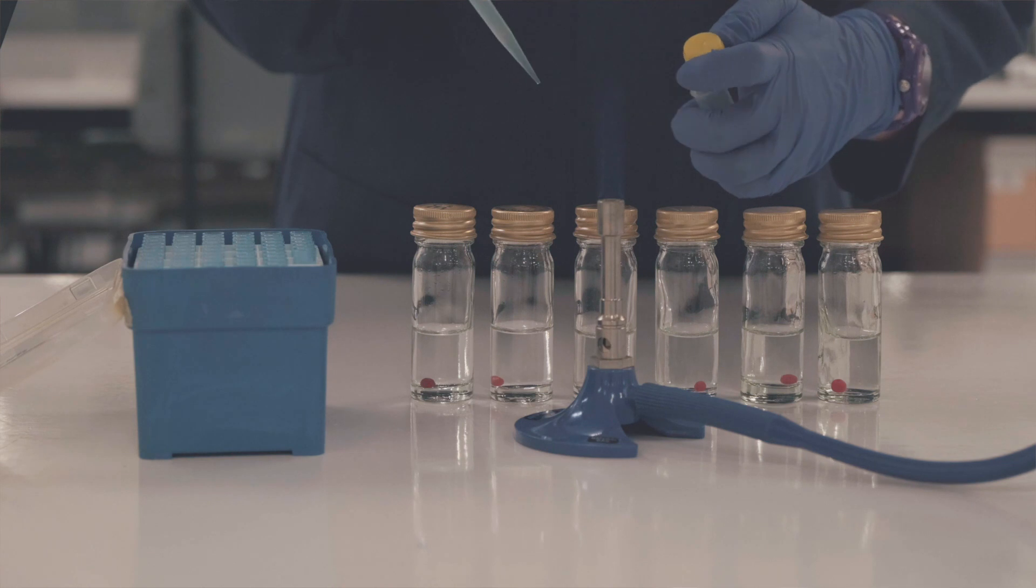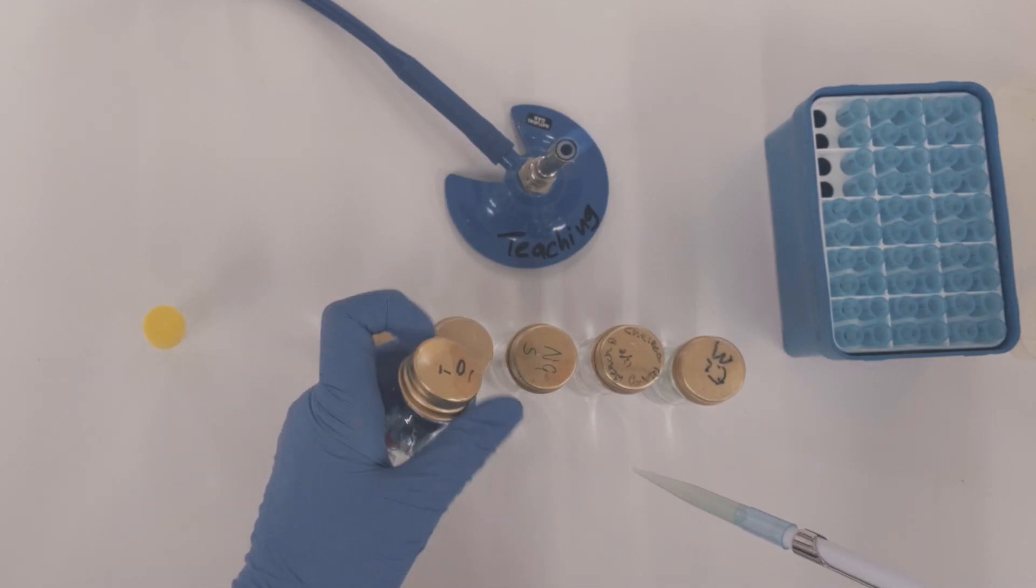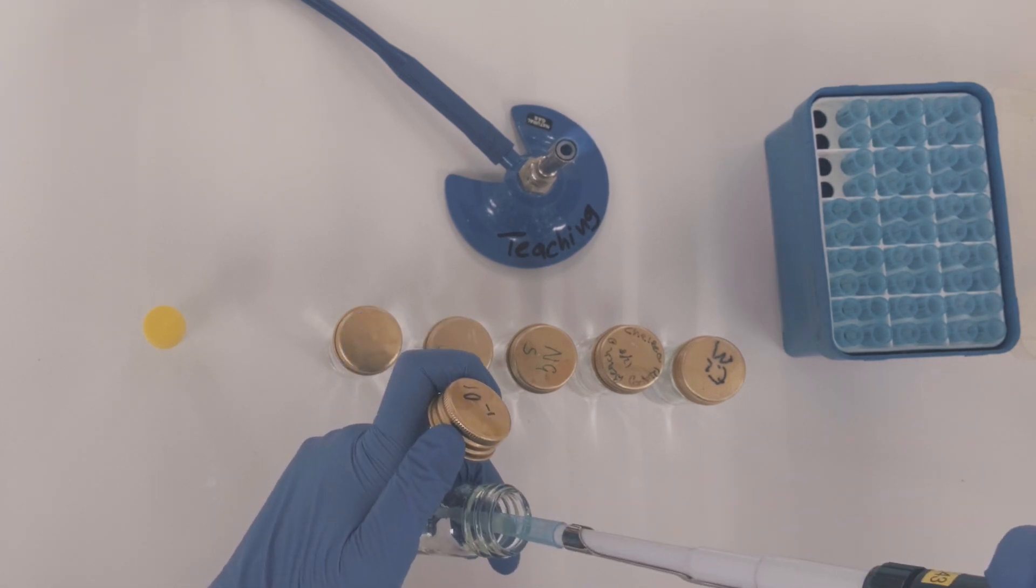If we watch the correct demonstration again in sequence, you can see 9 milliliters of saline is pre-aliquoted out into 6 bottles. 1 milliliter of the original bacterial culture is added into the first saline bottle.